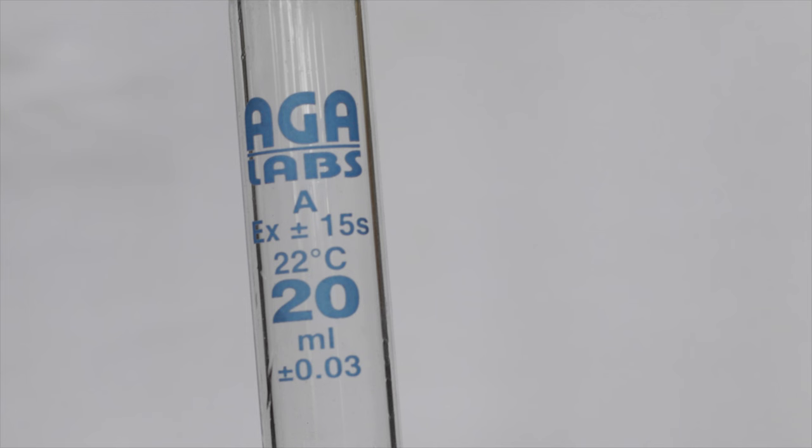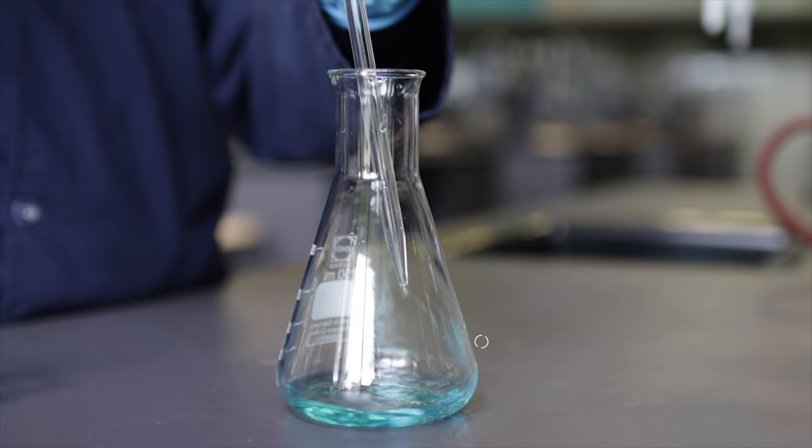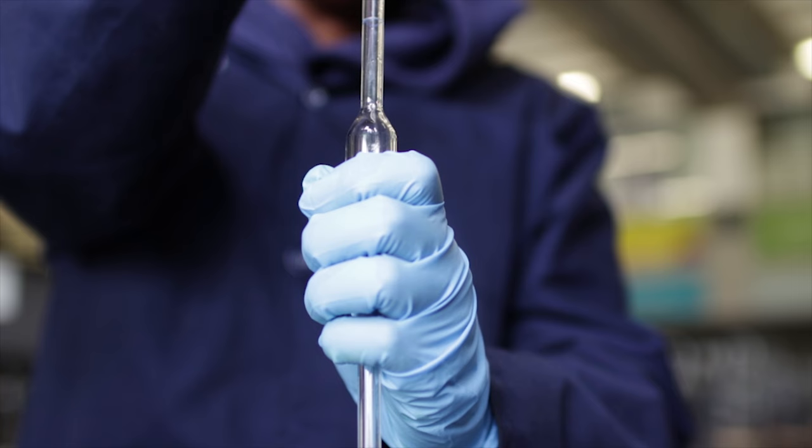For example, using the 20 milliliter pipette, it has an EX time of 15 seconds. However, if the pipette does not contain an EX time, assume the time is 15 seconds. The liquid that remains at the tip of the pipette should not be blown out into the flask.